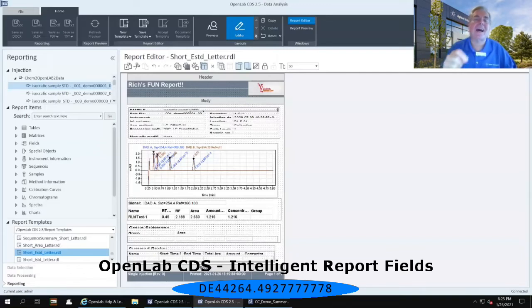But just because I can't change that without changing the information that's in there, doesn't mean I can't change its presentation. So with that first field highlighted, right mouse click on that and go down to the properties.